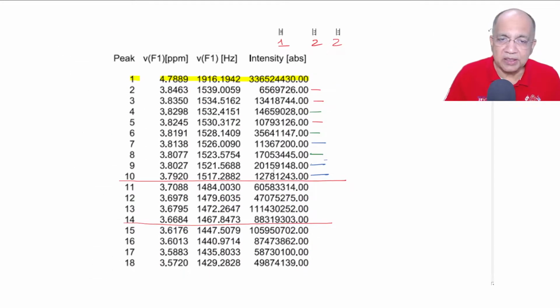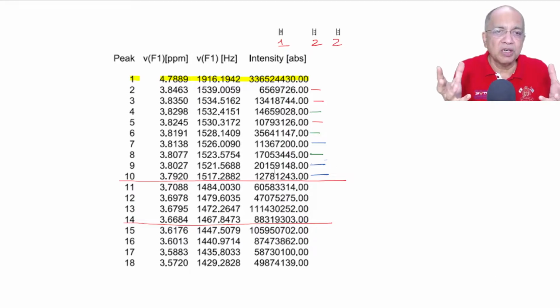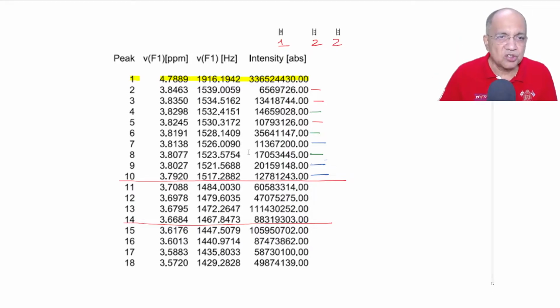Now, these are the data. I will show you how you have to make a calculation in an easy manner by using your Excel software. In a spreadsheet you have to take this data, because every computer spectrum will be associated with a data set. This is the ppm value of every line, the corresponding frequency value with respect to TMS, and this is the relative intensity value.